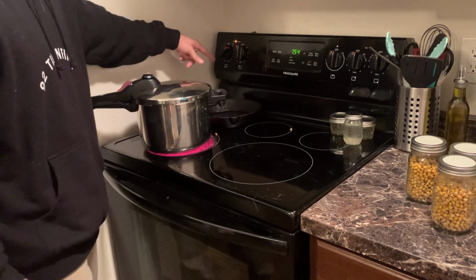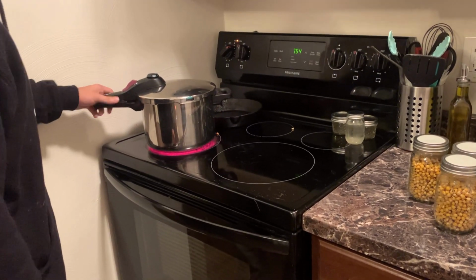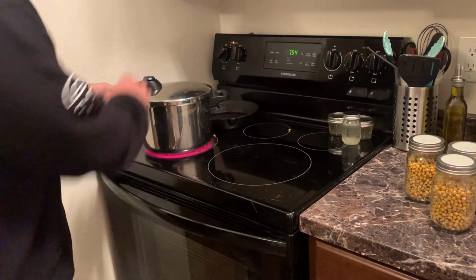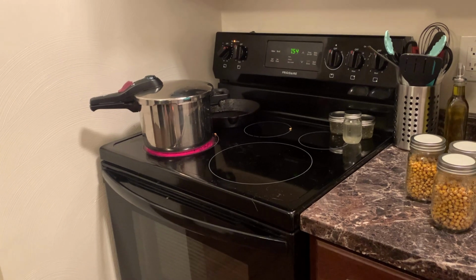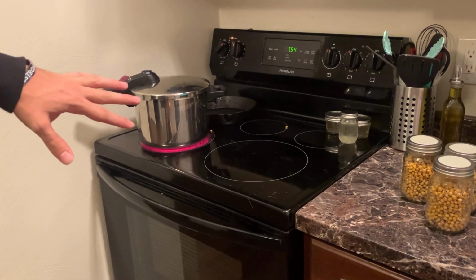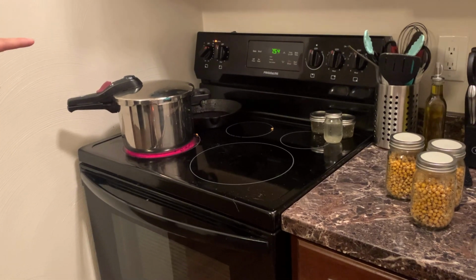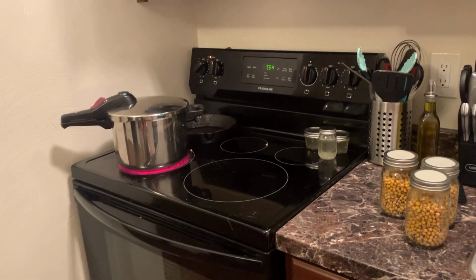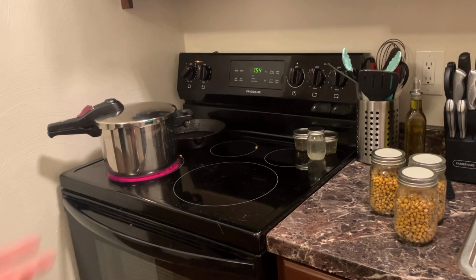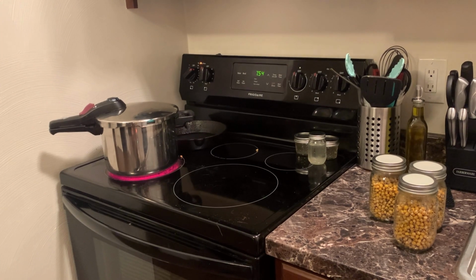Have it on high heat until that water's boiling. Once it's boiling, you're gonna start hearing that little whistle of your pressure cooker. And then after it starts whistling, you're gonna turn it down a little bit to about medium heat. And after it's whistling for 90 minutes, you're gonna go ahead and take it off of there and let them cool. And then we'll be ready for inoculation. So I'll see you guys after this sterilization time is up.